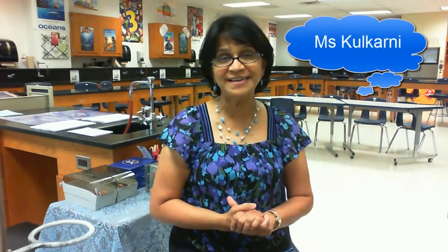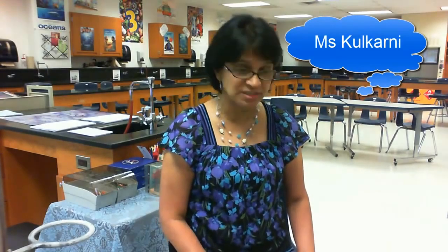I'm Sandy Kulkarni, and we are going to go over today our lab equipment which we generally use. We need to remember certain equipment by names and what they are used for.